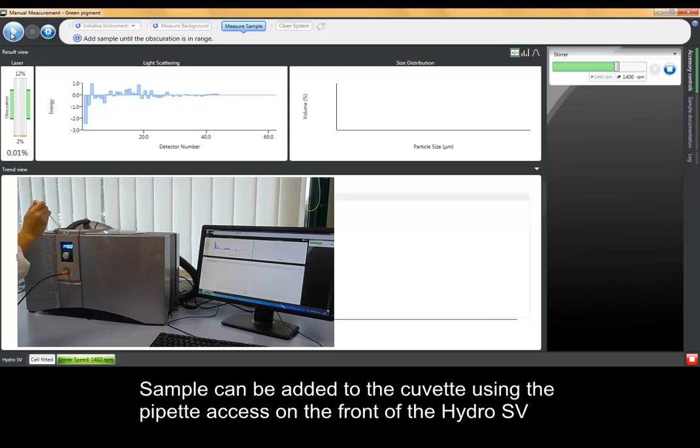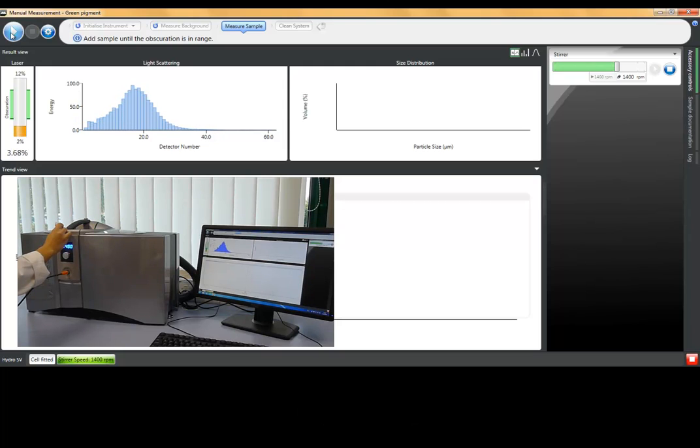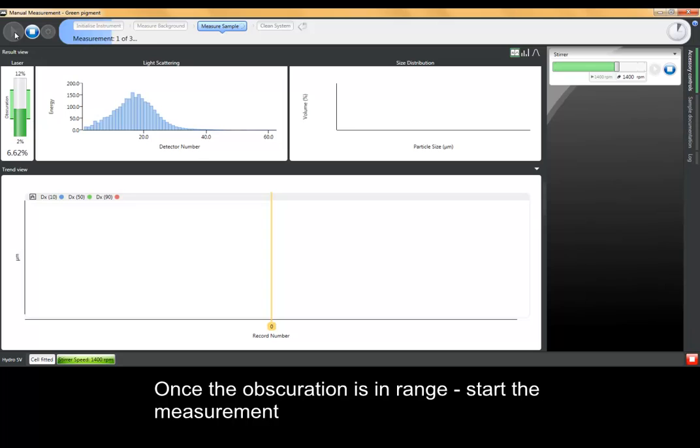Once the background has been measured, we can add the sample using the pipette access on the front of the Hydro SV. This allows you to see how much sample you have added and to control the obscuration at which you make a measurement. We can then start measuring the sample and in this case we are going to do three repeat measurements.